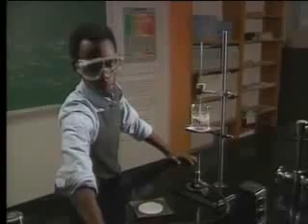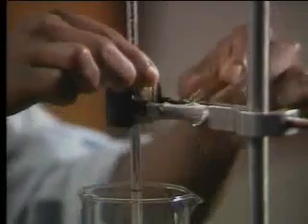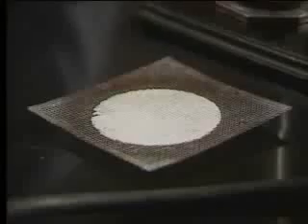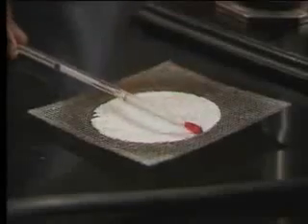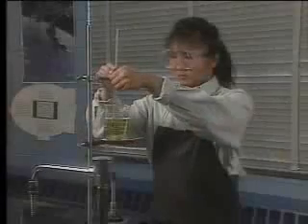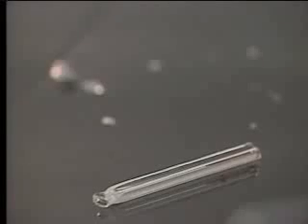No matter which type you use, always treat it carefully. When you're finished with it, set it down where it will be safe. Lay it away from the edge of the bench on a wire screen or towel so it can't roll off. When a thermometer breaks, the glass and any liquid that spills out must be cleaned up and disposed of properly. This is a job for your teacher.